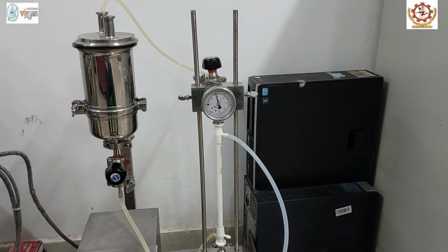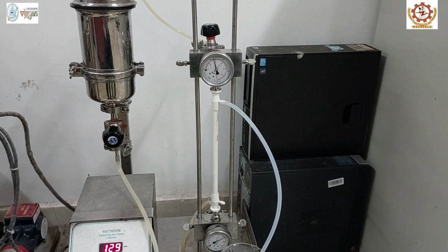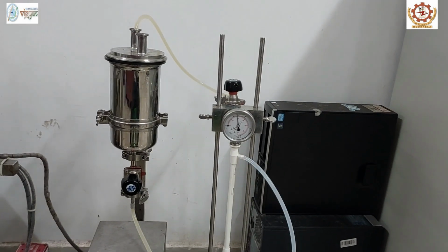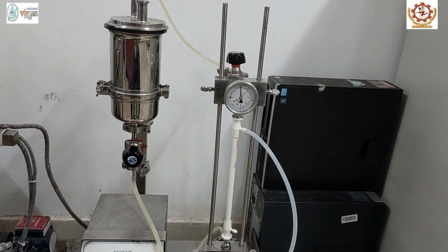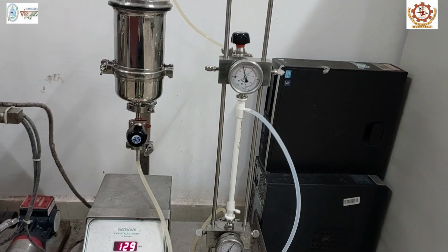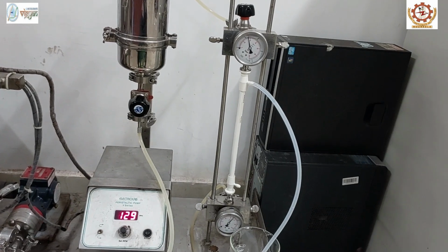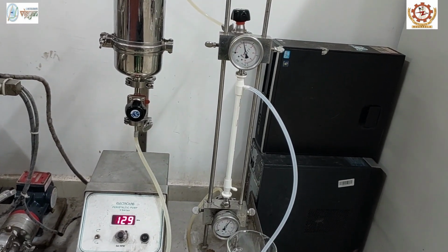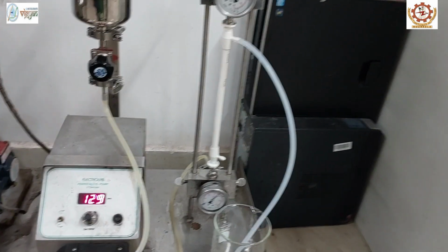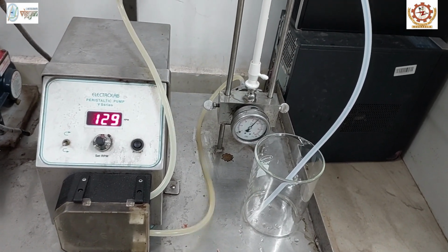The major constraint for using a membrane filtration unit is the fouling of the membrane. Fouling is one of the main concerns during membrane processing, since it can adversely affect the membrane functioning. In a membrane structure, there are different varieties of fouling, such as biofouling or biological fouling, inorganic fouling, organic fouling, and particulate or colloidal fouling.